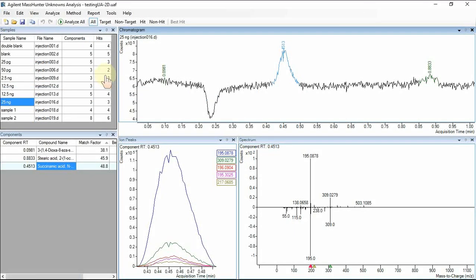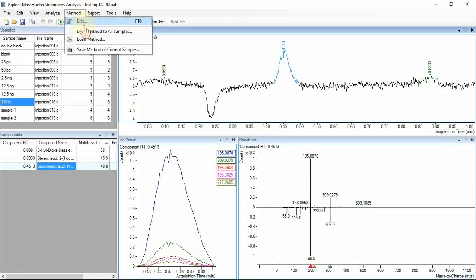Alright, we have used TIC on mass spec signals. As you see here, I've found components through library matching and library spectral match. But what about 2D signals? Well, in this batch, there's a TOF plus a 2D signal. So let's go to the method.